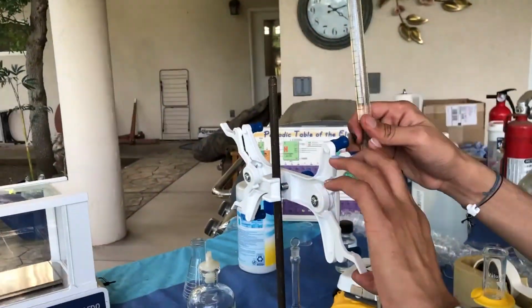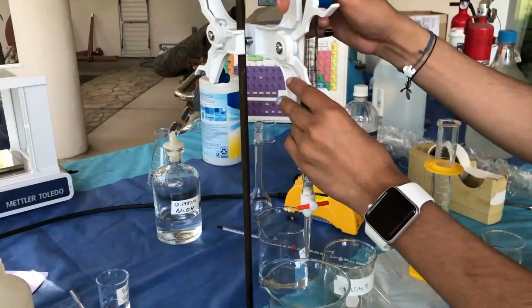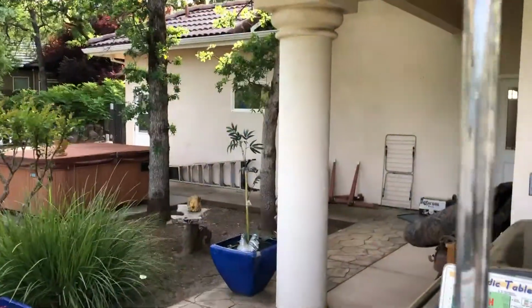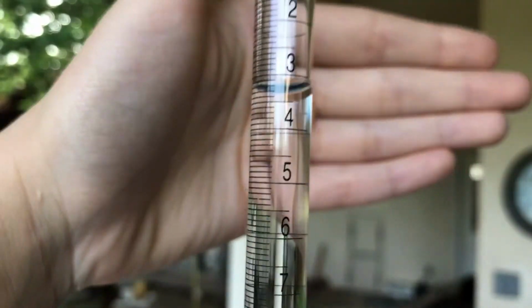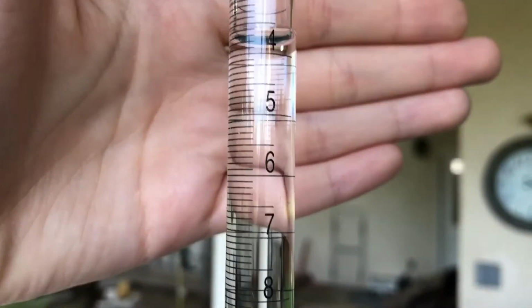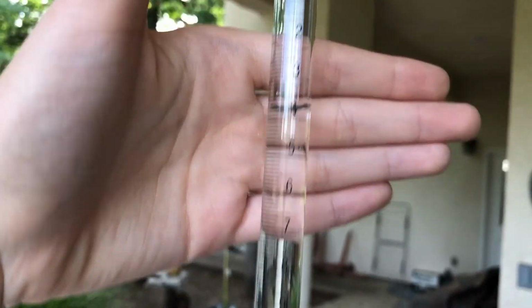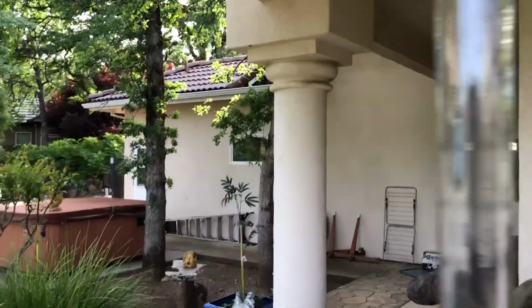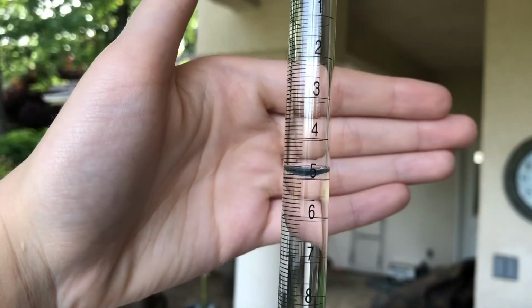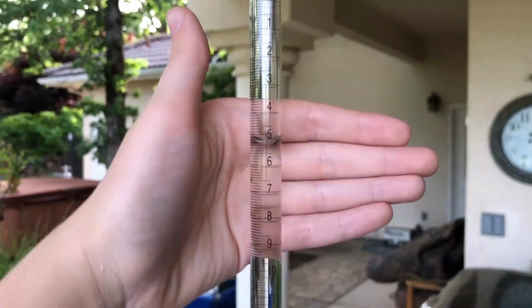So we're going to stick it back on the burette clamp, have our waste underneath, and we're going to let enough out. We're going to try and get it to this mark, so we're going to put it to the 5 mark. Andre's going to let some out on the bottom, and we're going to let it down to the 5 mark. Almost there. There, where the meniscus is hitting the 5. So now we're at 5 mLs as our starting point.